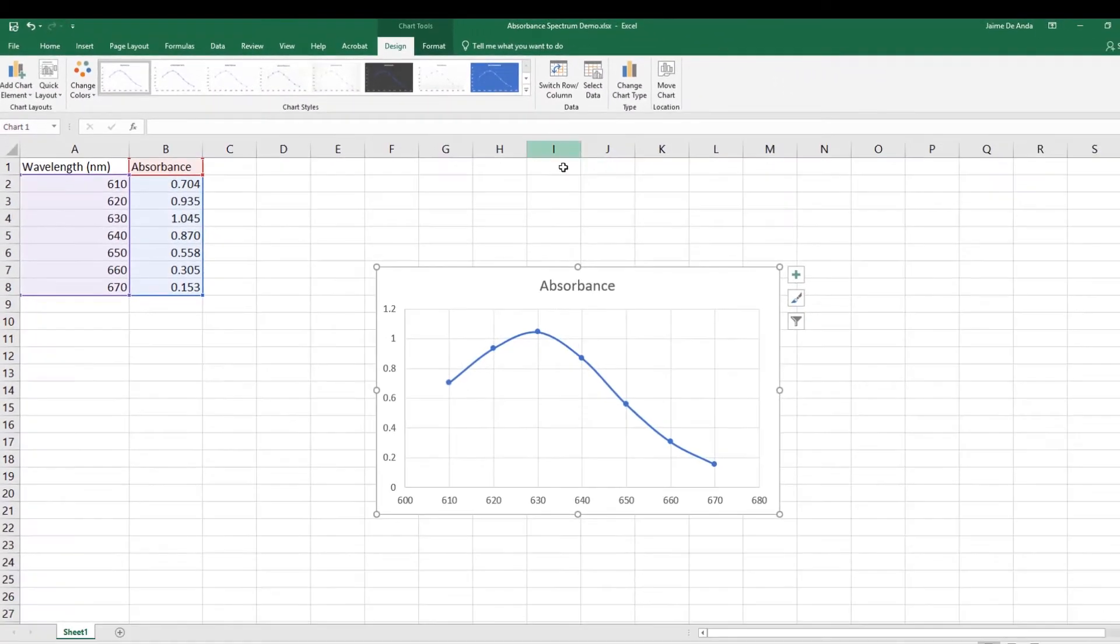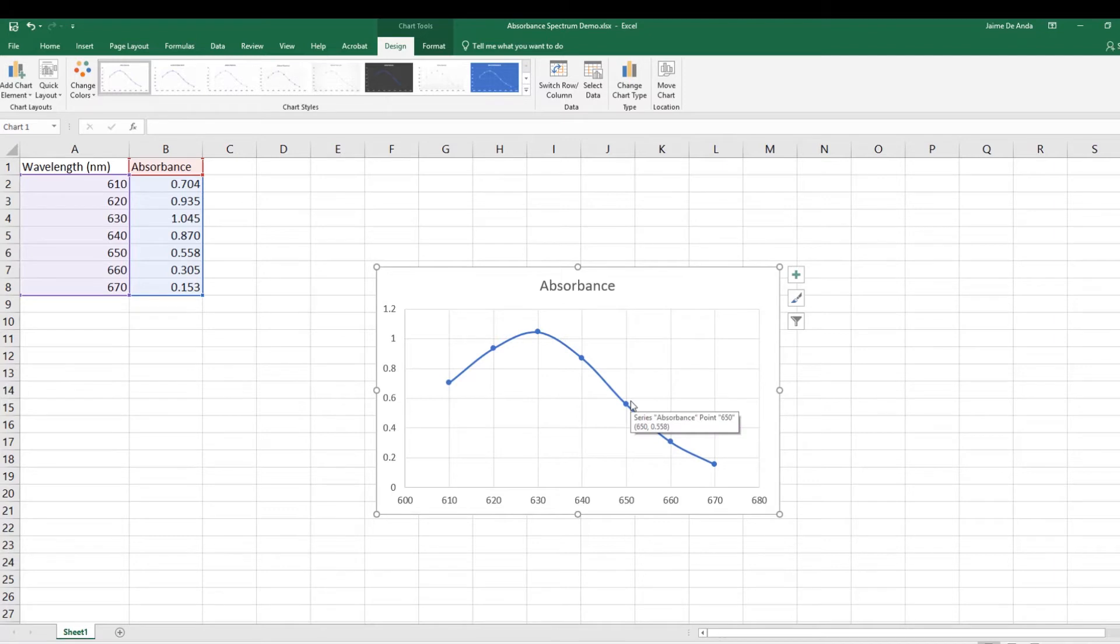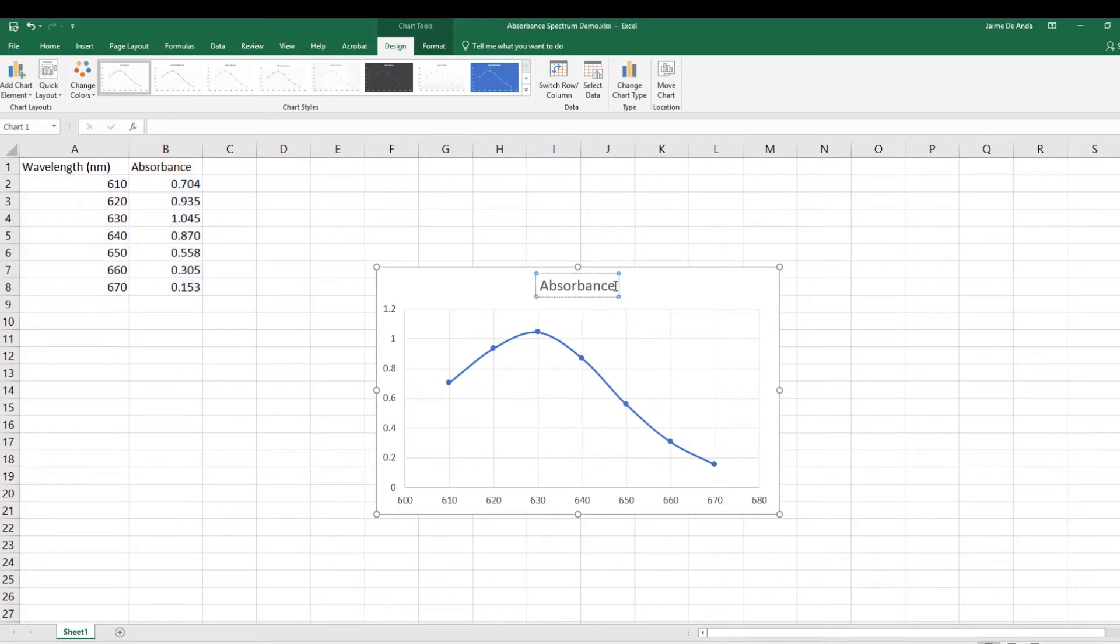Now I have to format it. So for example, for the title, this is going to be an Absorbance Spectrum.